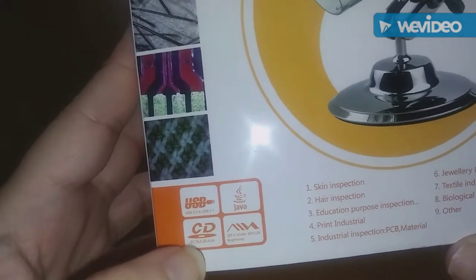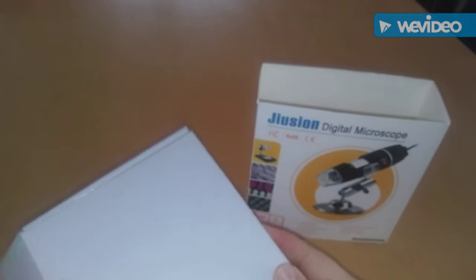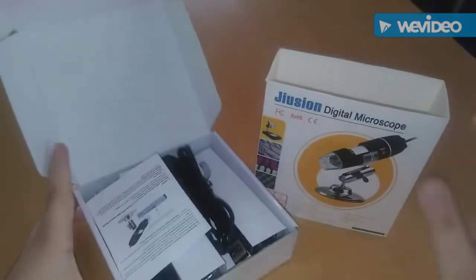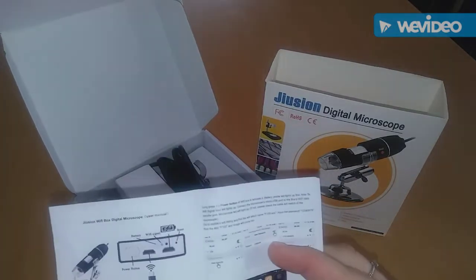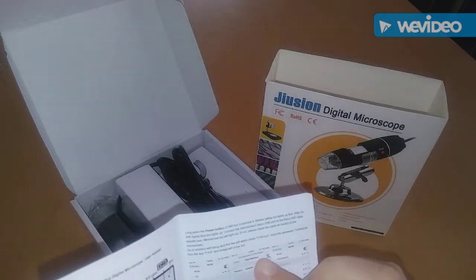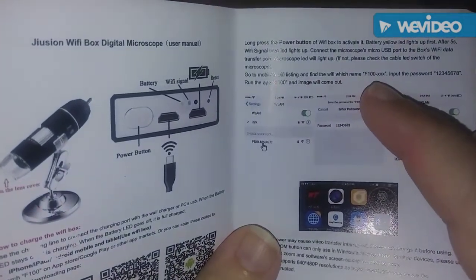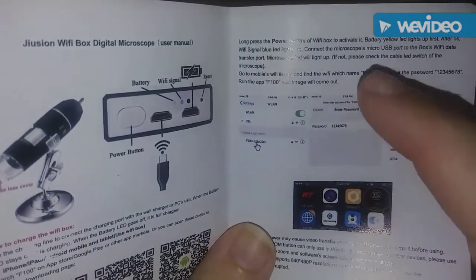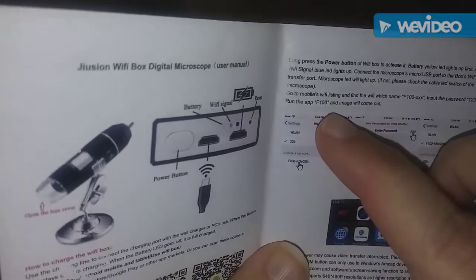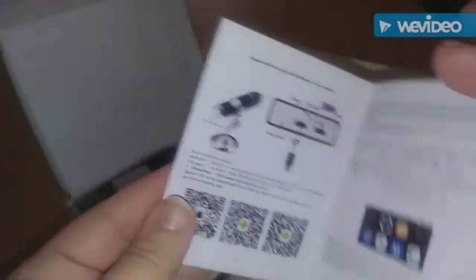It comes with the CD, the USB plug, and I'm going to show you. I used it yesterday and it was pretty awesome. I was able to see quite a bit of things in here. It's really easy to connect to. You need to set it to your mobile WiFi and you're going to connect to F100-XXX, which I did. That's the password there. Then you're going to run an app which is F100, and then you're going to be able to see the image from the microscope.